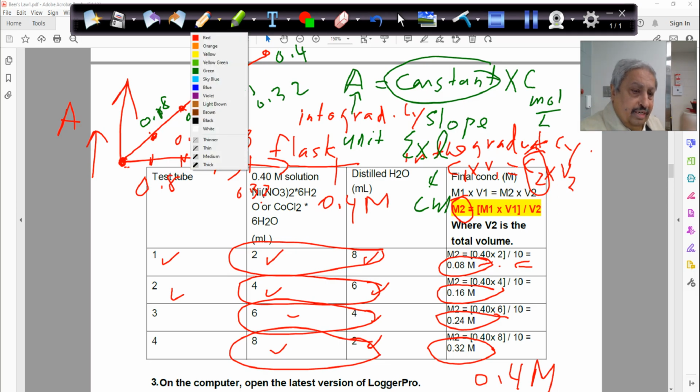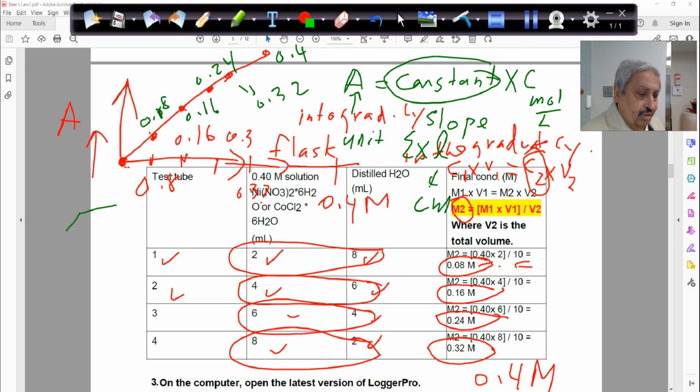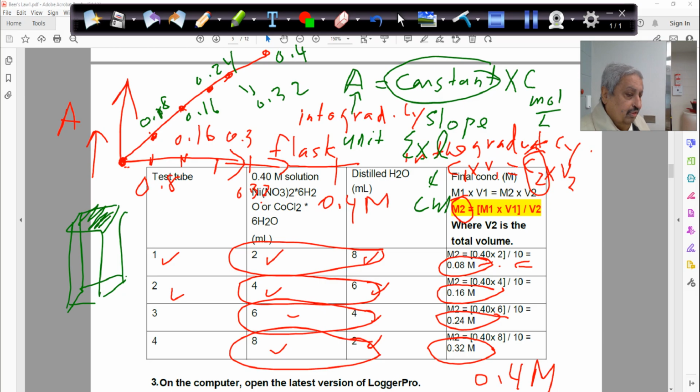There is an unknown here. Don't open the cuvette. It's ready to go and covered with plastic. Do not take the plastic apart. Take it out of the cuvette holder, it's already ready to go. Just CHEM wipe the side where the light will go through, put it in, and see what its absorbance is.